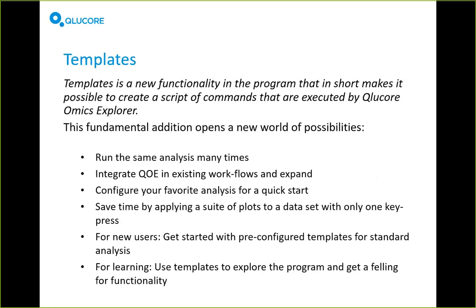With Omics Explorer, you could write your own Python program to interpret this data and output it in a format that our software can read. You could also have Omics Explorer run and trigger external events, like starting up an external tool and doing parts of the analysis outside Omics Explorer, and then bring the data back in by reading data into Omics Explorer. And here, configure your favorite analysis for a quick start.